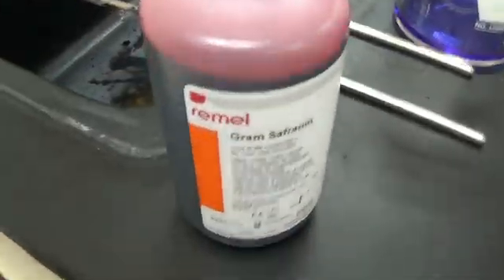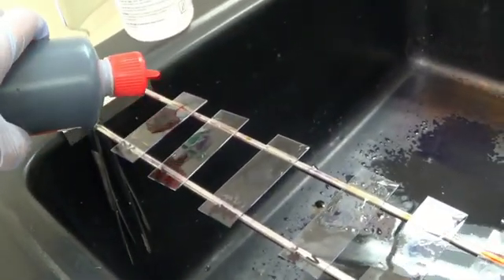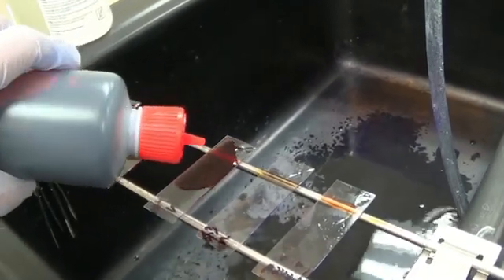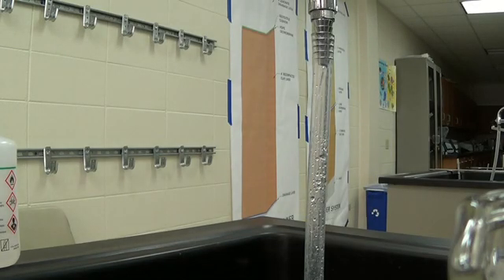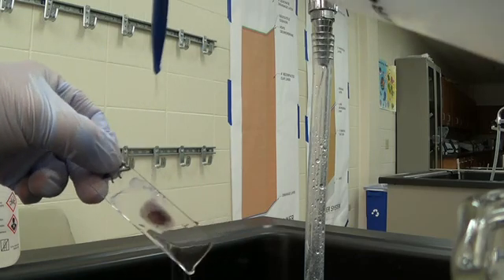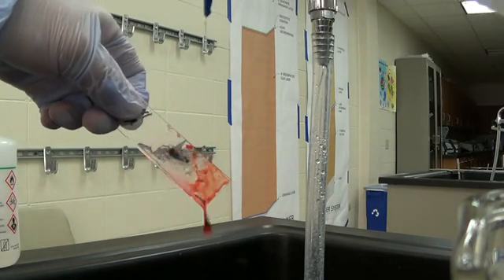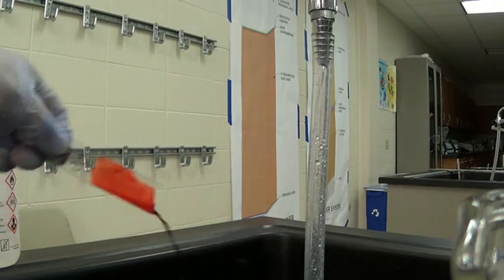The next thing to do is add the safranin — I believe this step is 30 seconds. After 30 seconds, rinse the slide nicely and well because that is the end of the gram stain. After this, just let the slide dry.